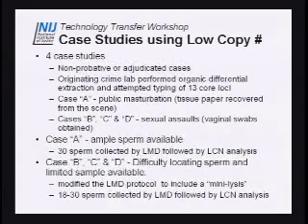So I'm going to warn you right now that these case studies aren't really a great test for the laser microdissection system, but they do provide some information on how it can be used to help analyze cases, because we ended up modifying the protocol since we could not find enough sperm.